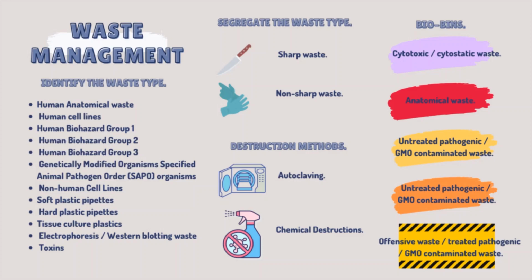Moving on to laboratory biological waste disposal guidance. Prior to disposal, the waste has to be segregated into non-sharp waste and sharp waste. This is to reduce the chance of injury or needle pricking while disposing of rubbish.